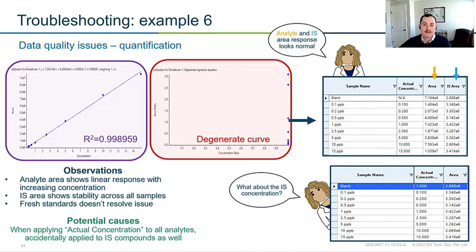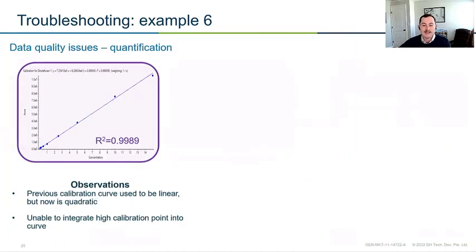In our software, for example, there's an option to apply concentrations to all. And if you don't have your internal standards listed as internal standards when you do this, it's going to apply just your standard concentrations. Super easy fix, though. All you've got to do is go into your software and enter the true concentration of your internal standard. But I figured I'd mention it because I've seen it a lot, and it's just an easy thing to happen, but it might not be super obvious the first time it happens to you.